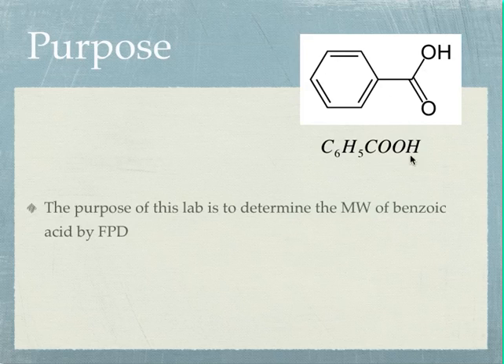And if you take a look at it, this is the actual compound, C6H5COOH. Now, even though you know it, we're going to actually pretend that we don't know it and see if the molecular weight that we actually get in the lab matches up with what the periodic table tells us.